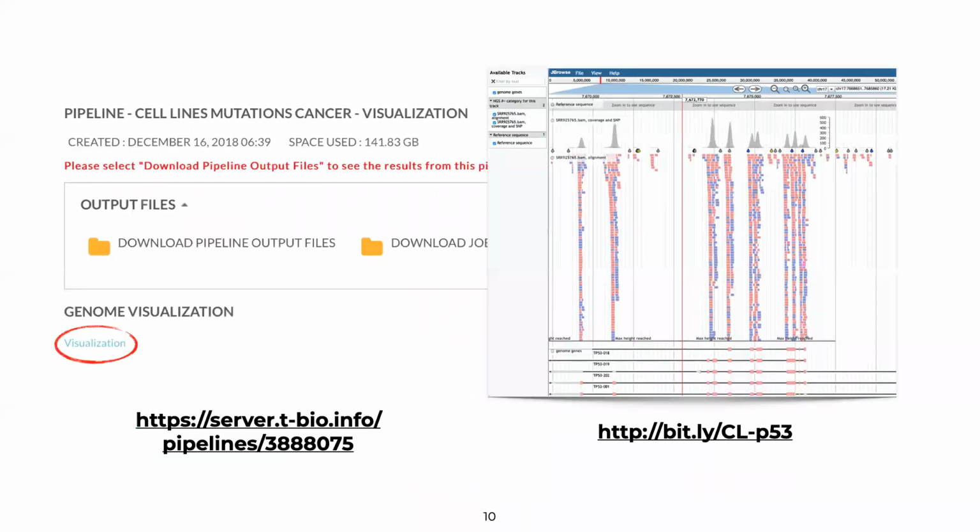So let me ask you a question. One of the examples that you probably saw was an example using cell line data. These are breast cancer cells. And we briefly looked at that example last time that we spoke. So as you look at this picture here on the right, what type of sequencing do you think this is? Is this whole genome, whole exome, or targeted sequencing?